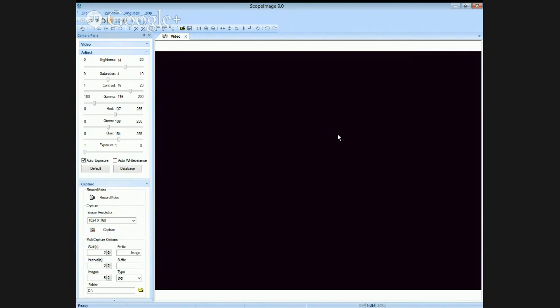It's the same stuff that makes up our fingernails. This is a form of chitin, and that's not a very good image of it because this microscope is a little too clear and close. It's looking for something that's a little more... there we go. Okay, that's a pretty good view. So you can get an idea of the layering over here. If you look on the side, you can see where these layers and these little pieces are built up and built on top of each other.